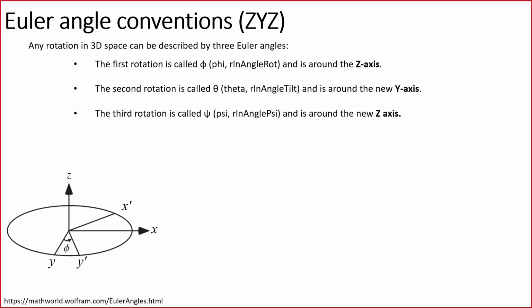But there is also the convention ZXZ, and the convention ZYX. You will see that these conventions only differ in how the rotations are performed in sequence.